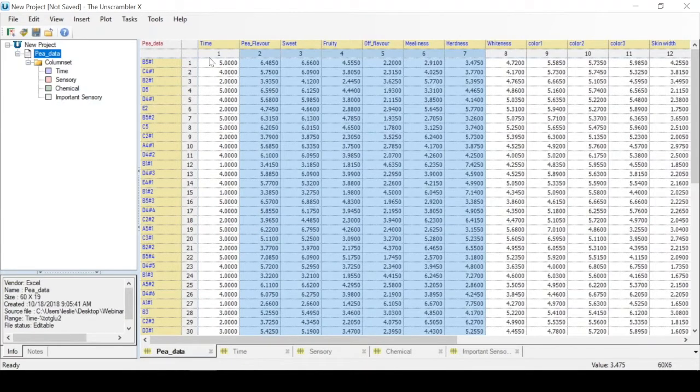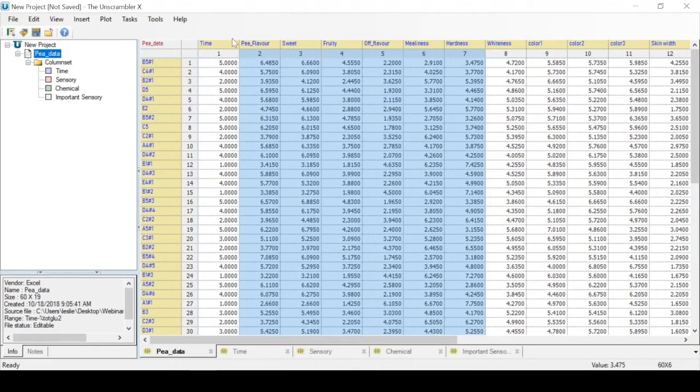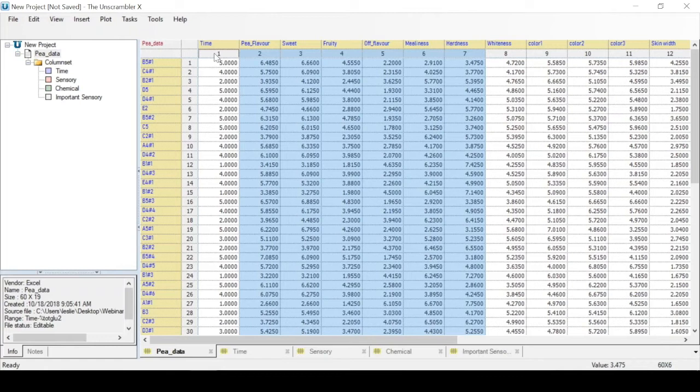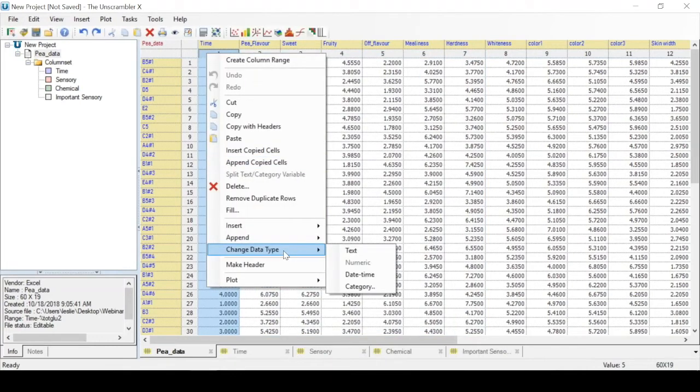Finally, if we go back to our data, we want to define the time variable as a category variable, so that we can color samples based on five different groups of time points. To do this, we select the time column, right click, and press change data type, followed by category.